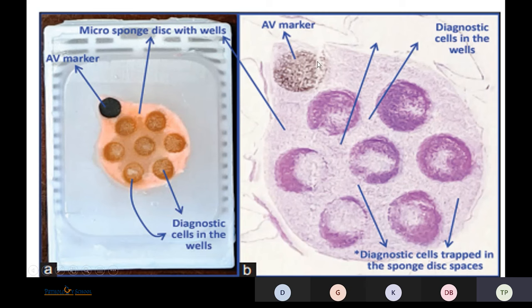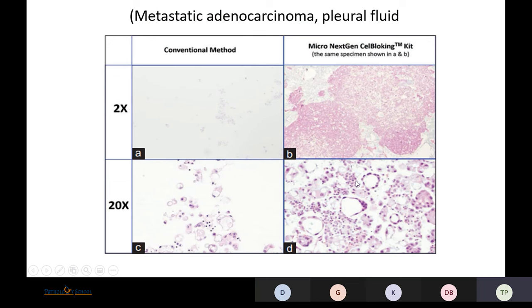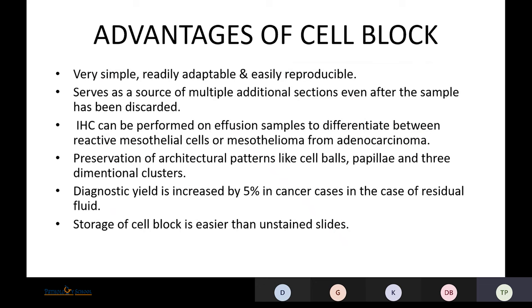The micro unit with paraffin-embedded section shows the wells and the AV marker — a sectionable black-colored inclusion. On histopathology, you can appreciate the AV marker and the diagnostic cells in the wells. Comparing conventional routine methods versus micro next-generation cell blocking kits, you can appreciate that the conventional method shows less cellularity, while the micro next-generation kit yields very good cellularity and allows appreciation of architectural patterns.